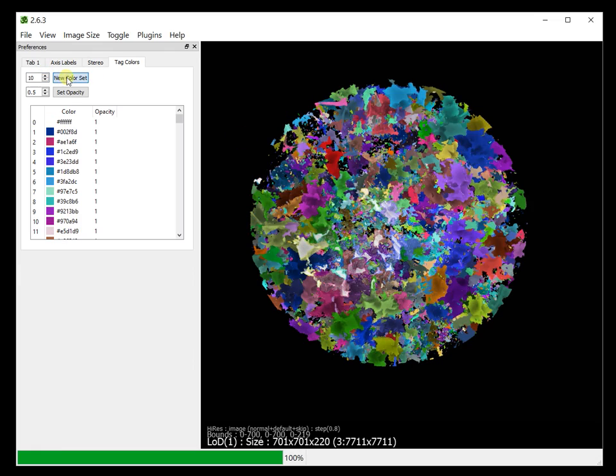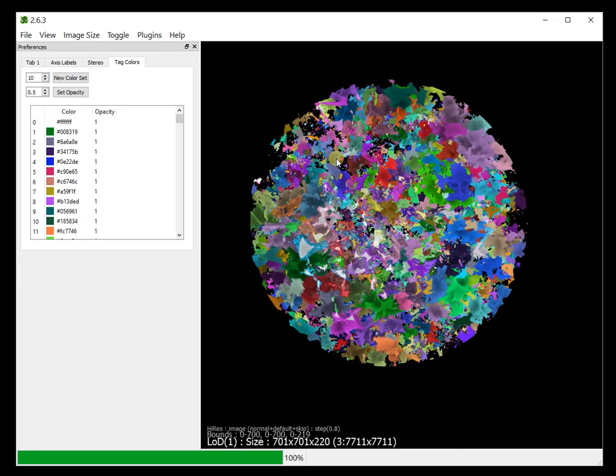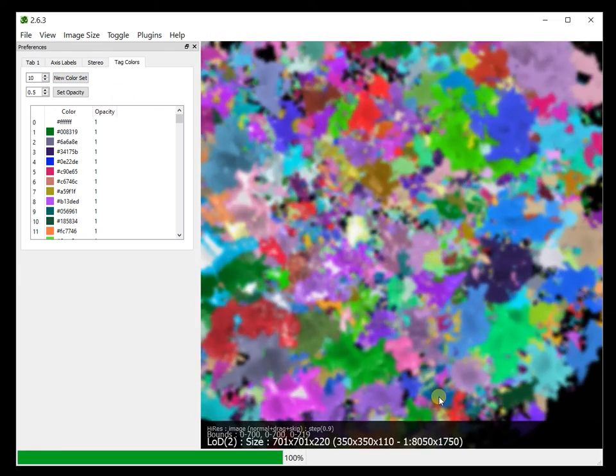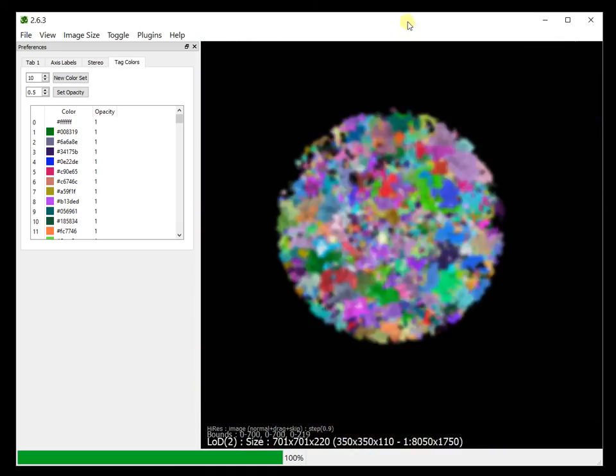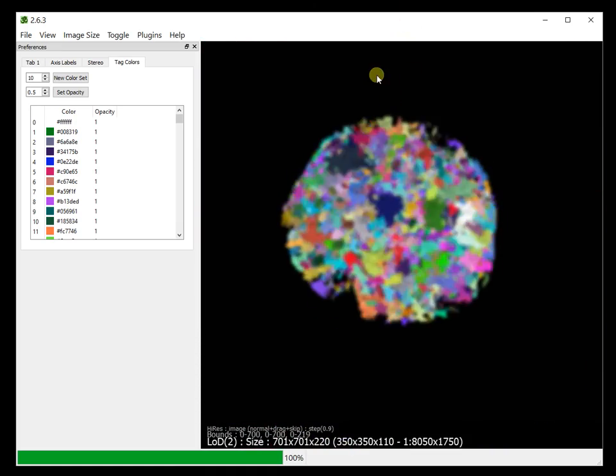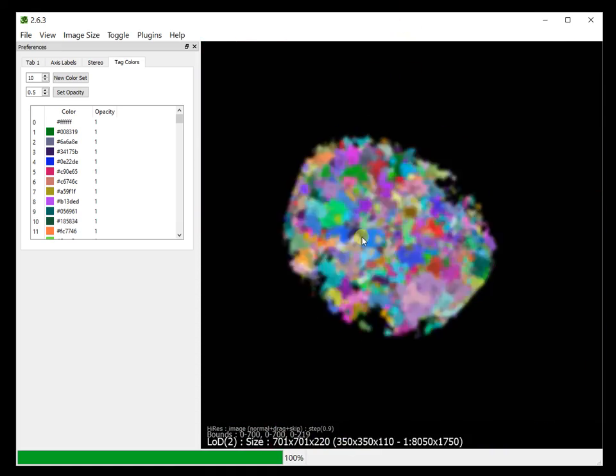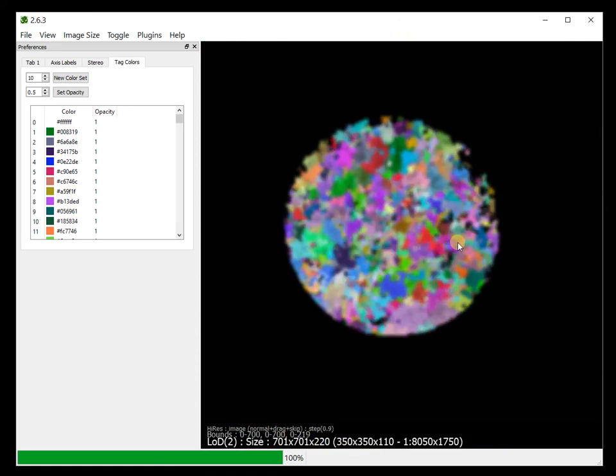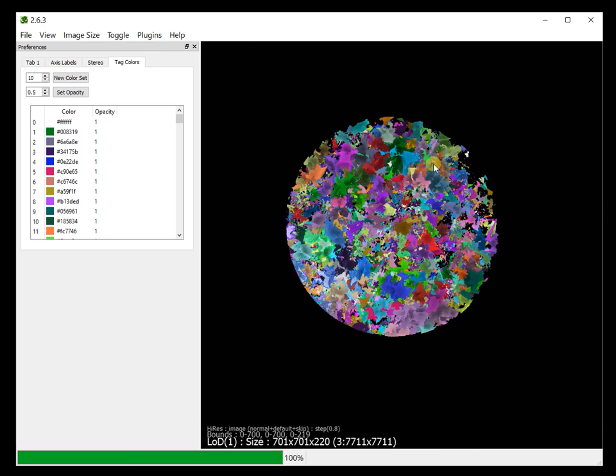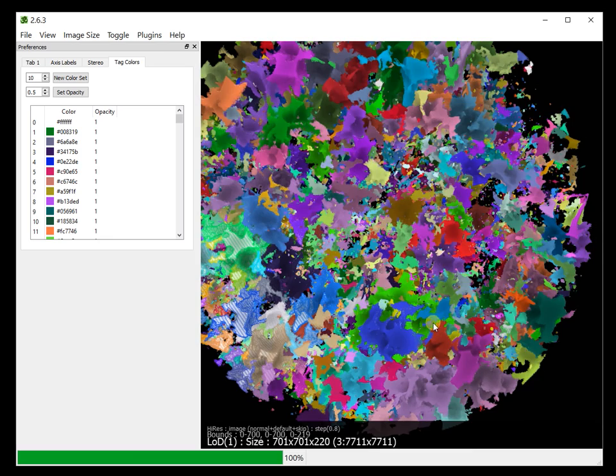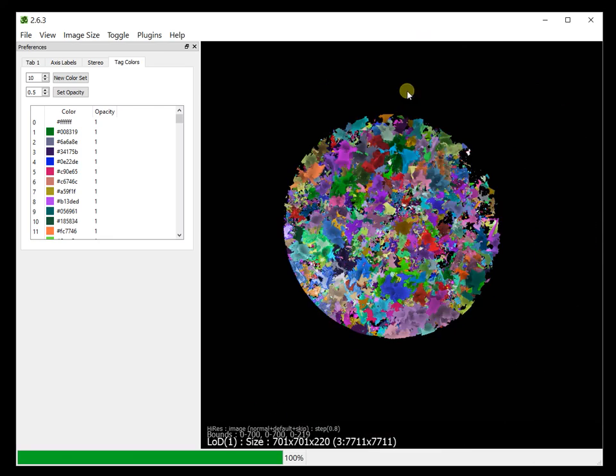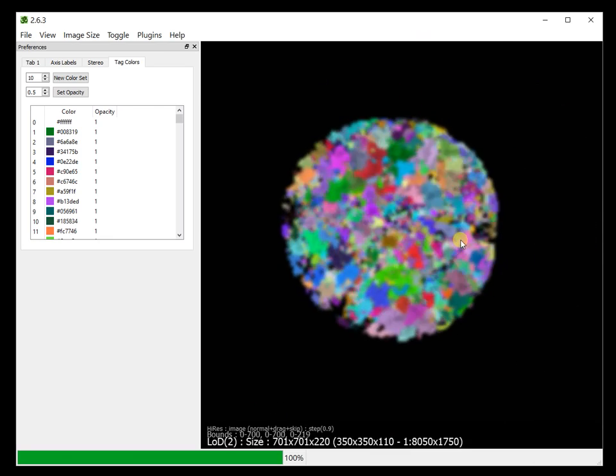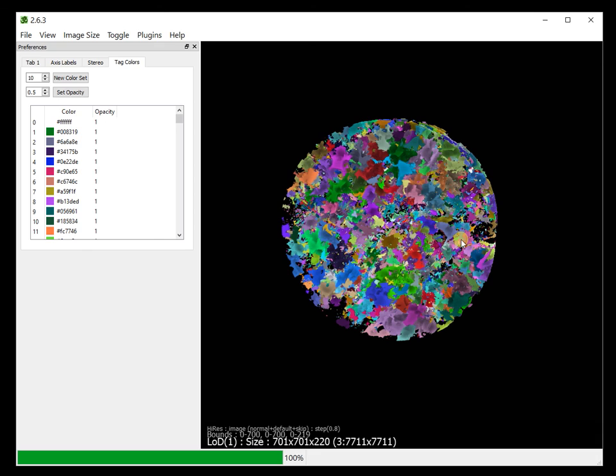So this is the way in which you can apply or view your segmented data with random colors. Even if it is 16-bit, and the same holds for 8-bit data. So just use mix tag and you would be able to visualize your segmented data.